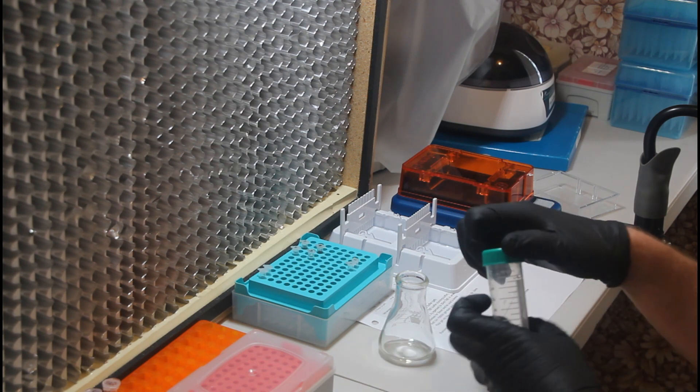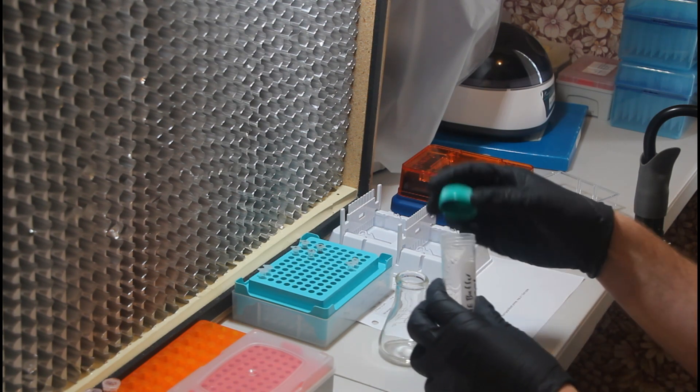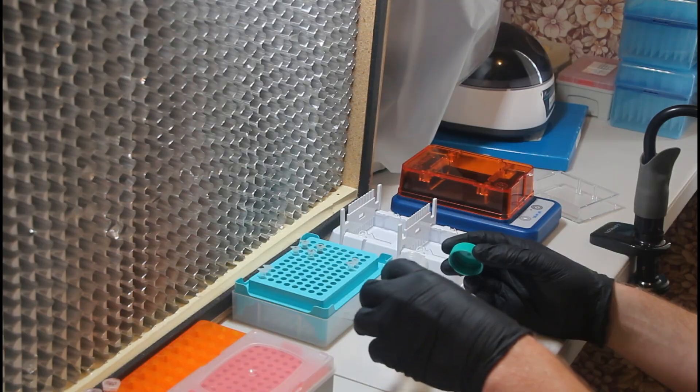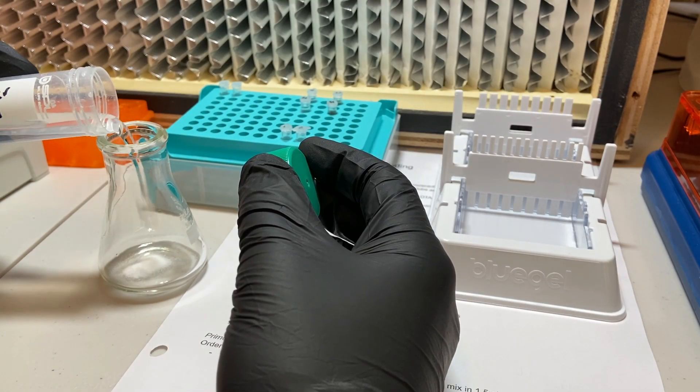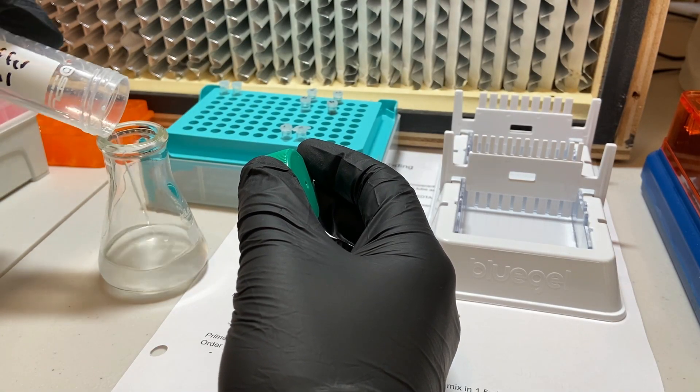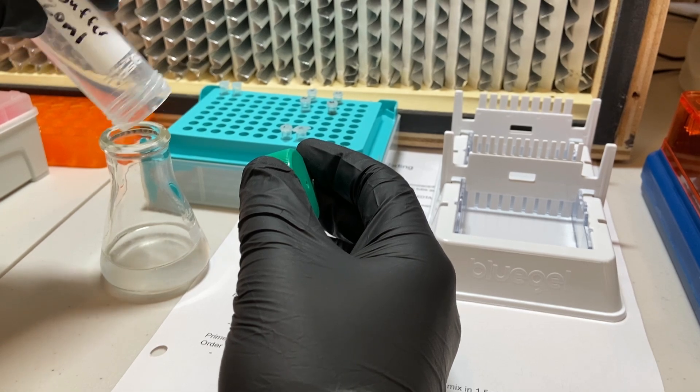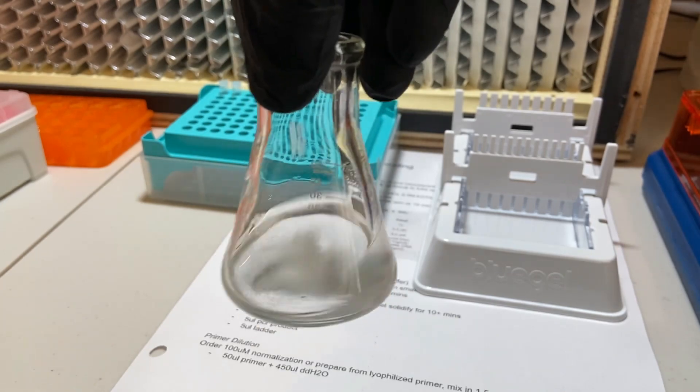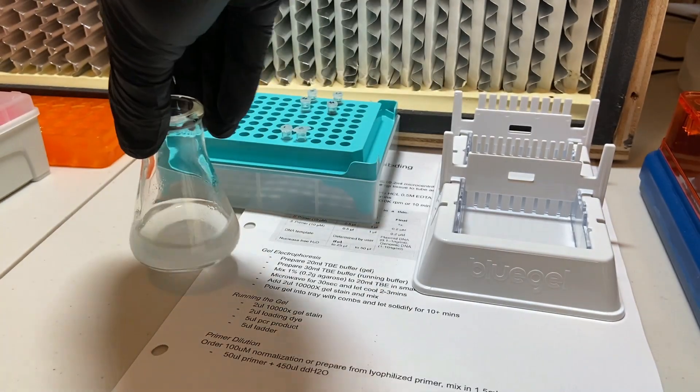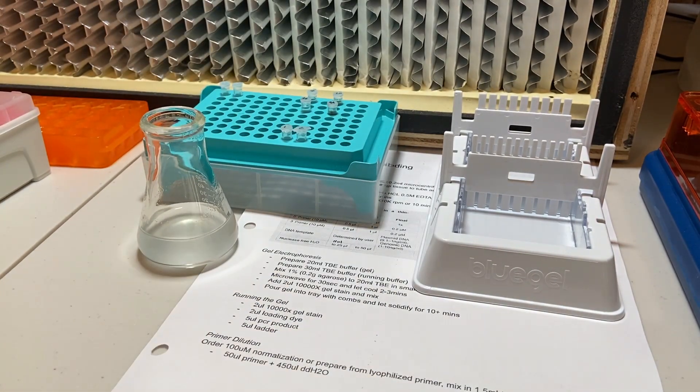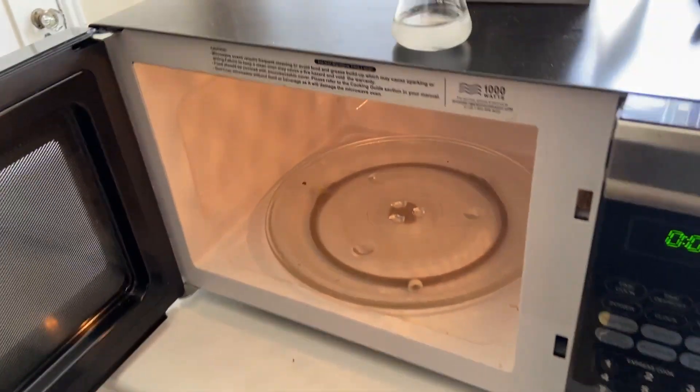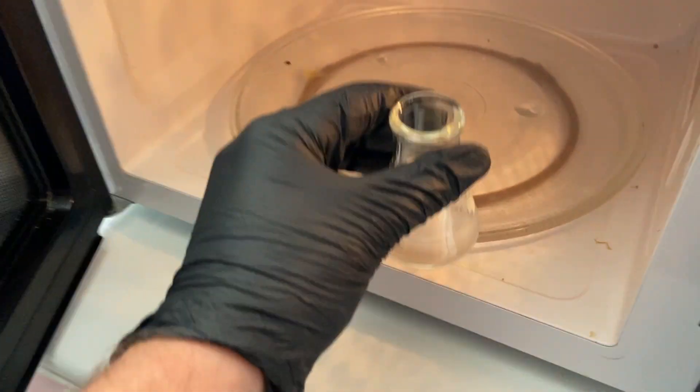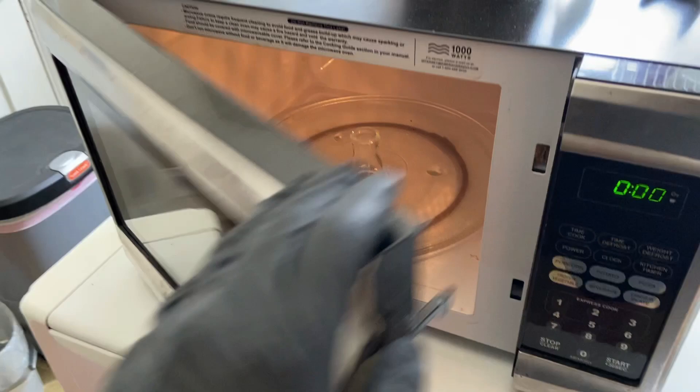So after you've added the agarose to a small flask, we're now going to mix in the 20 milliliters of 1X TBE buffer. And gently swirl it. Otherwise, you're going to get dry agarose gel up around the edges. And we're going to pop that into the microwave to melt the agarose for 30 seconds.